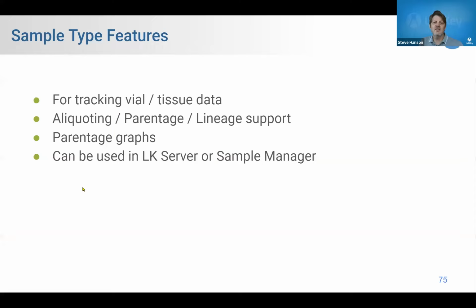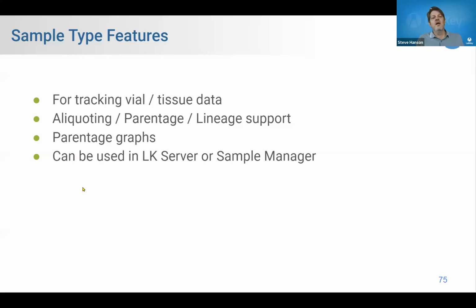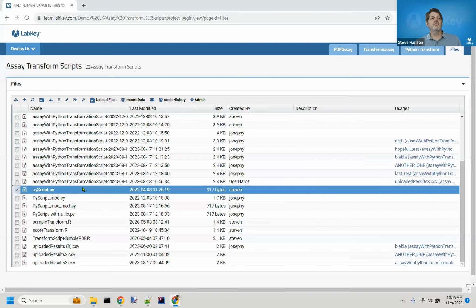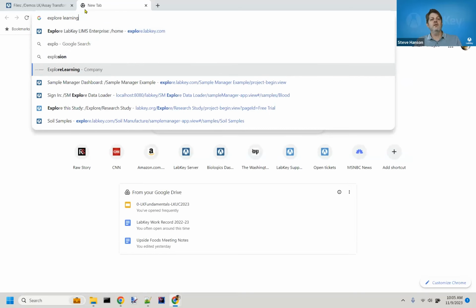This is Sample Manager. The whole world of samples has really been under a revolution at LabKey in the last 4 years. We've done all kinds of work around samples. We've really built a product around samples called Sample Manager. And it's a great product. It comes with every premium edition of LabKey Server. If you have a premium edition, you already have access to this product. So let's take a look at it briefly. We have a good example right here.